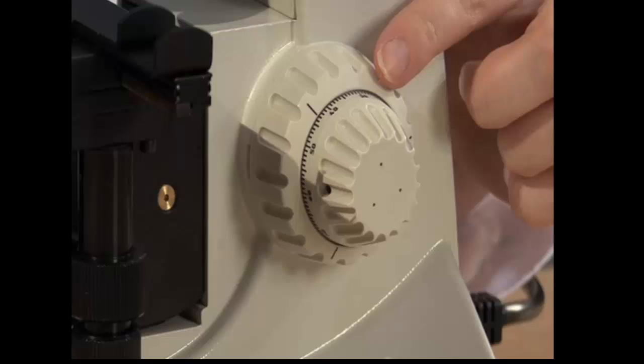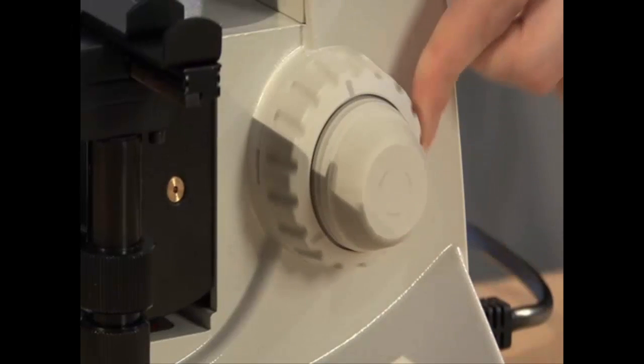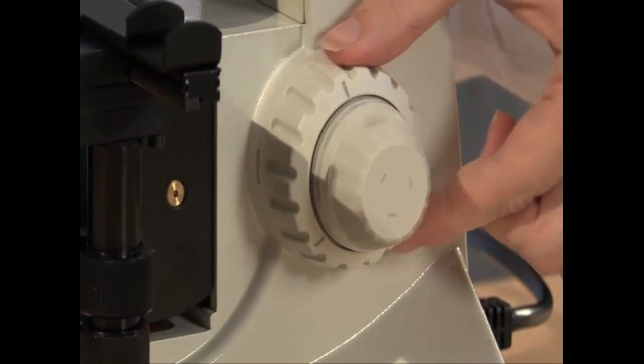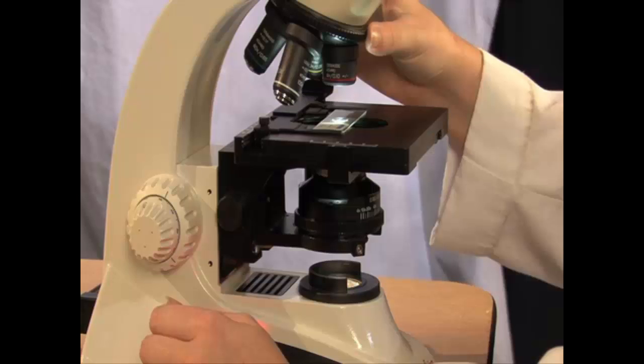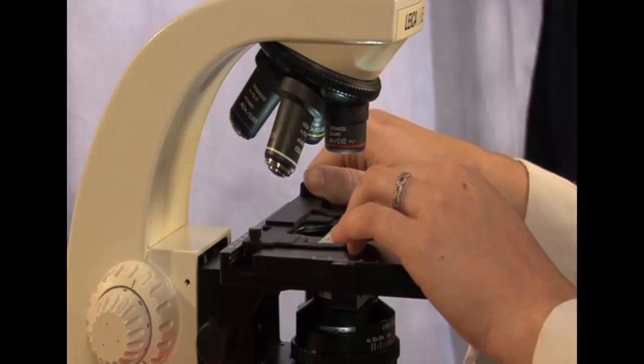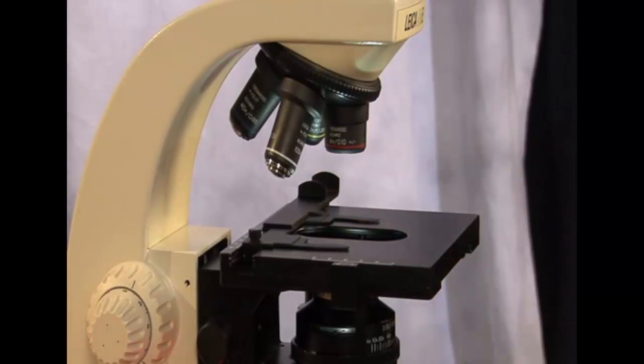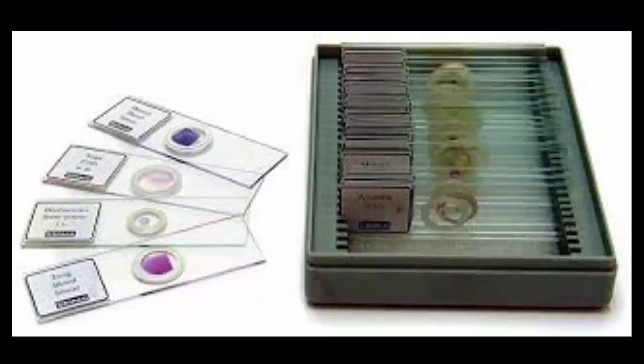Now, let's say we have finished viewing this specimen and we are ready to view another. Simply use the coarse adjustment knob to lower the stage to its lowest position and then rotate the objectives back to the scanning power. Squeeze the slide clips and remove your slide. It is important that you put your slide back into the slide box immediately.